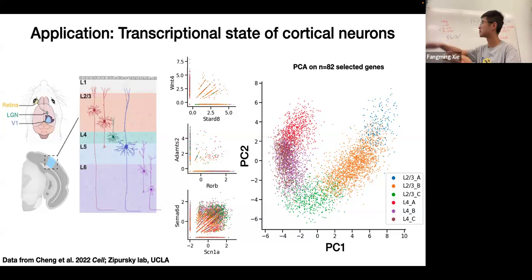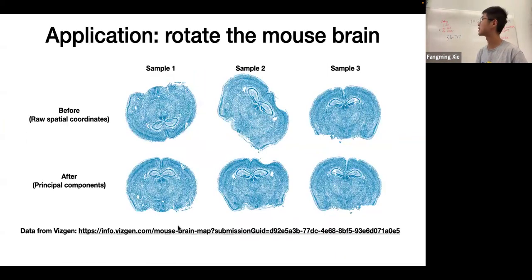In this case, it's a data set of the mouse cortex where we know the cells' properties vary along the layers of the cortex, and that structure is automatically shown in the first 2 PCs; cells go along a gradient continuously. Whereas if you choose a pair of genes, you need to figure out what you're looking at, right? And you need to figure out the right genes and maybe the right combinations of them. Okay, so that's one use case.